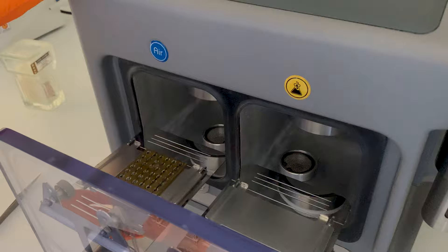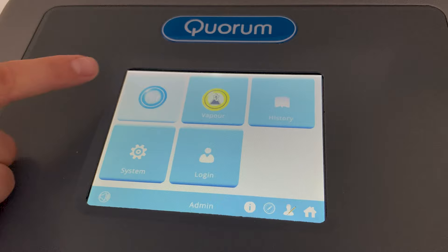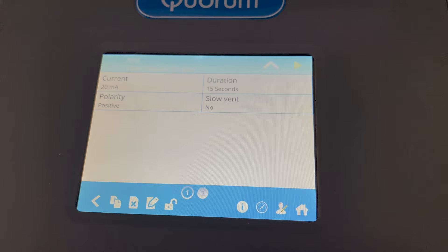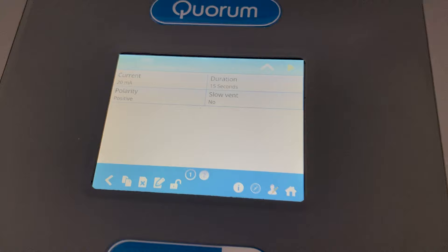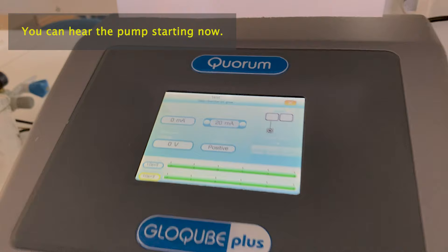Gently, so we don't drop the grids — just place it there in the middle. Now I'm going to go into the air clean menu. For hydrophilic negatively charged grids we currently have a program called 'test'. You can see the parameters: it runs for 15 seconds and the current is 20 milliamps. You can create your own custom programs, but let's start with this — it's the gold standard that works for most samples. I press the green triangle to start the program.